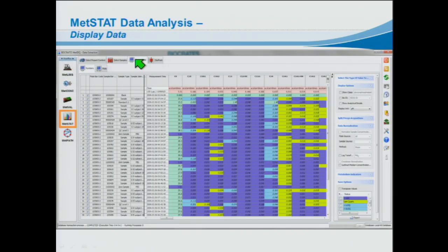Just by clicking on the next tab, the data of the selected samples is loaded into this user interface. And as you see, we have the sample information available here, as well as the metabolites and the concentration values in micromolar. Of course, we have annotated them. You can just click on the BioID button and select an ID, and then it shows which BioID these molecules have. The colors here represent the validation status, whether they are valid or if there is something wrong. What you can do on this user interface is change the unit, so you can also export in different units than micromolar.